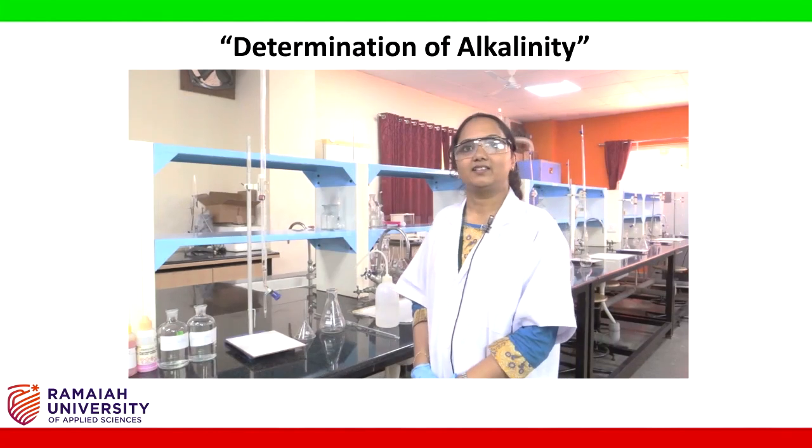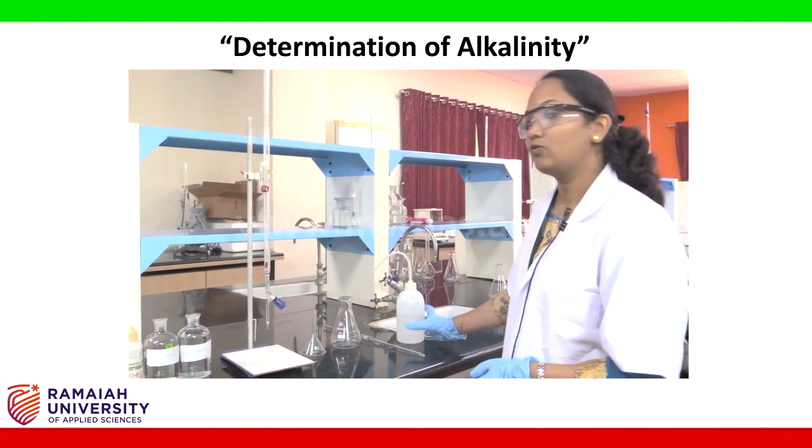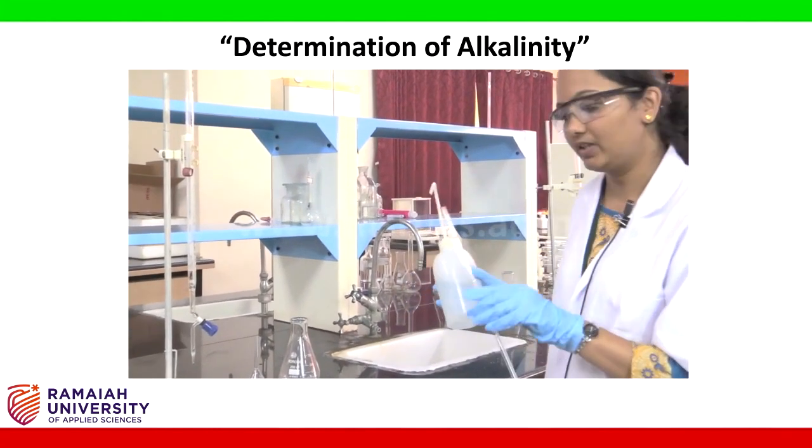Before conducting the test, we need to rinse all the glasswares. This is the wash bottle with the distilled water. So we are going to begin rinsing with the pipette.